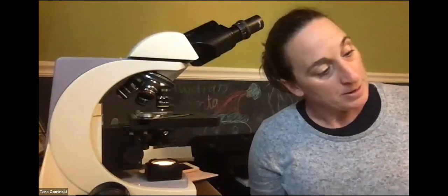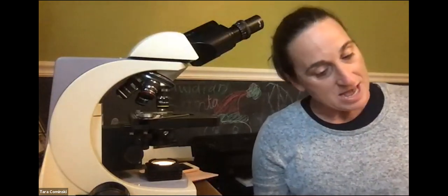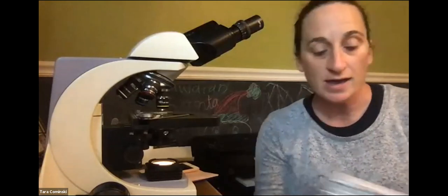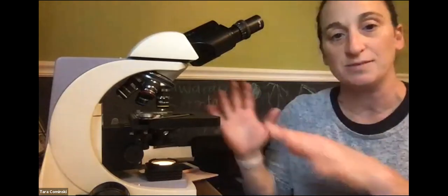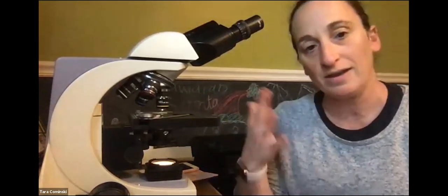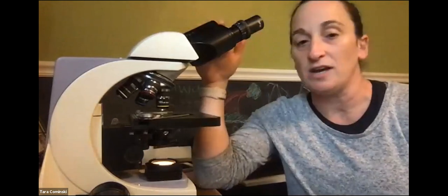Okay, so like I said, you don't need to know the parts of the dissecting scope. Therefore you're pretty much skipping page 17 and page 18. That brings us to page 19, and that is using the compound light microscope. Like I said, that's the microscope we will use most often in our courses. So we will need to identify the parts of this microscope.